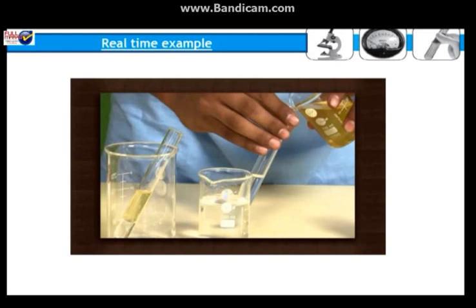In hard water, the hydrophobic end of soap is trapped due to scum or precipitation with the calcium and magnesium salts. This makes hard water unsuitable for washing.